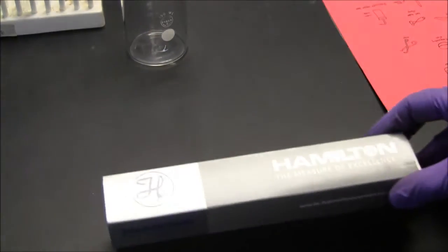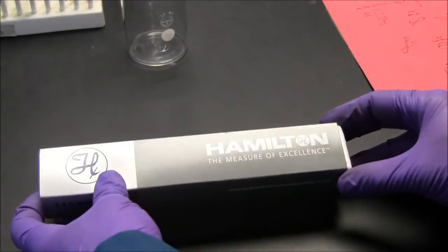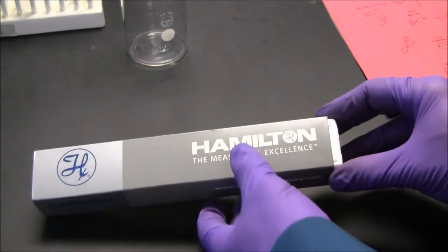Hamilton is a brand and they make syringes as well as some other products, and as it says, this is the measure of excellence.